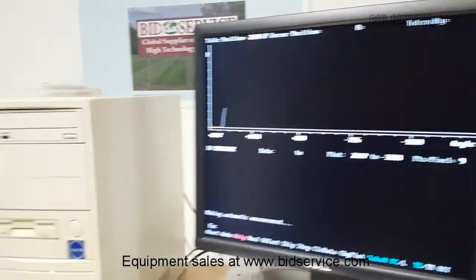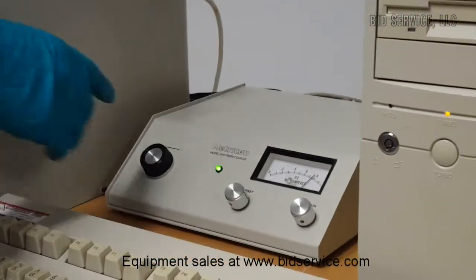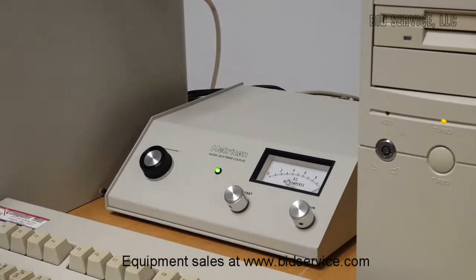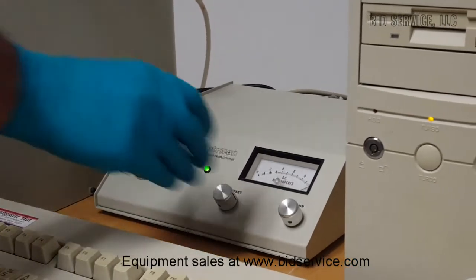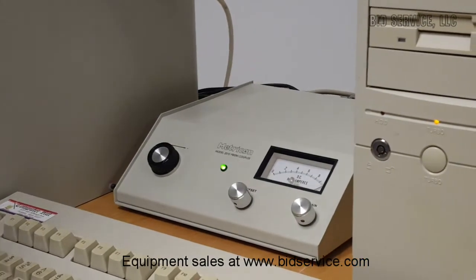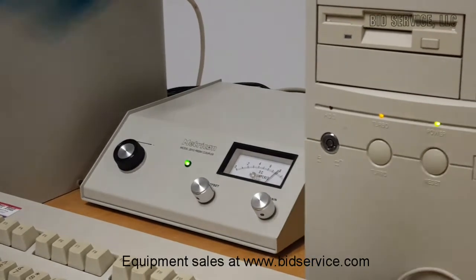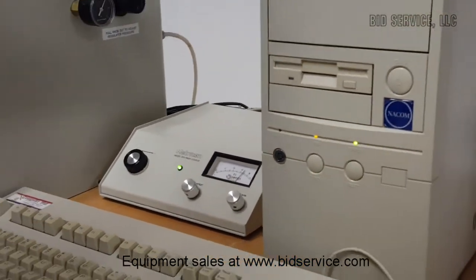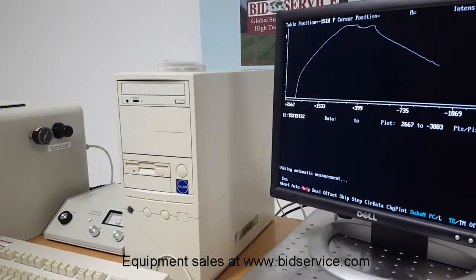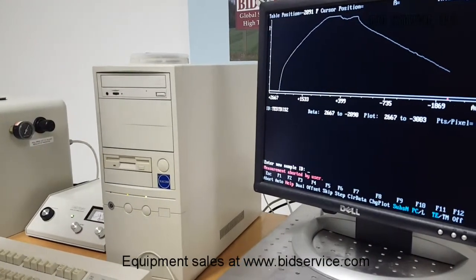So there are offset and gain knobs on this prism coupler control module, and there is a table rotation knob here. This rotation knob can be used when manually the peaks are to be located, and the gain can be adjusted in order to bring the intensity plot within the scale, so it cannot go above the scale. So gain and offset should be adjusted. So my gain was too high, or the offset was off, so I'm going to replot it.